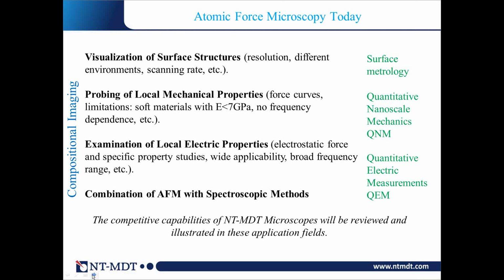When I was attracted to this scanning probe microscopy field in the end of the 1980s, there was practically only scanning tunneling microscopy, and atomic force microscopy appeared as an accessory to the scanning tunneling microscope. But more than 20 years have passed, and now atomic force microscopy is the dominant scanning probe microscopy technique with a variety of applications.